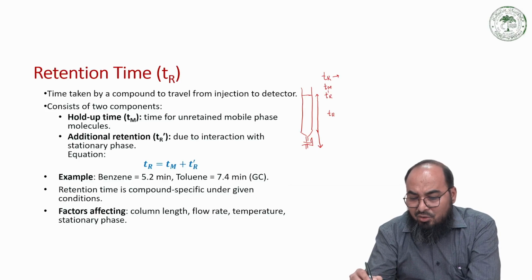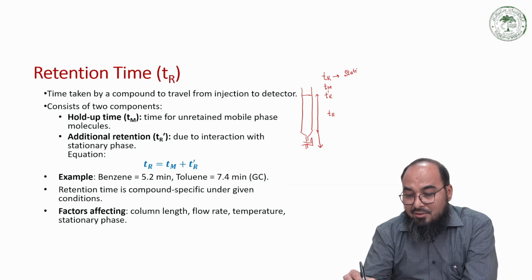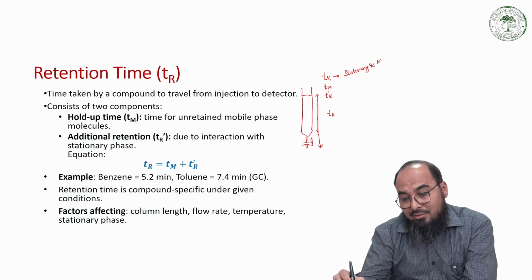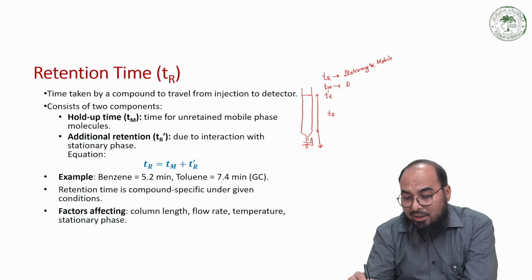So it gives you interaction of the stationary and mobile phase. It gives interaction only with the mobile, and it gives you only stationary.